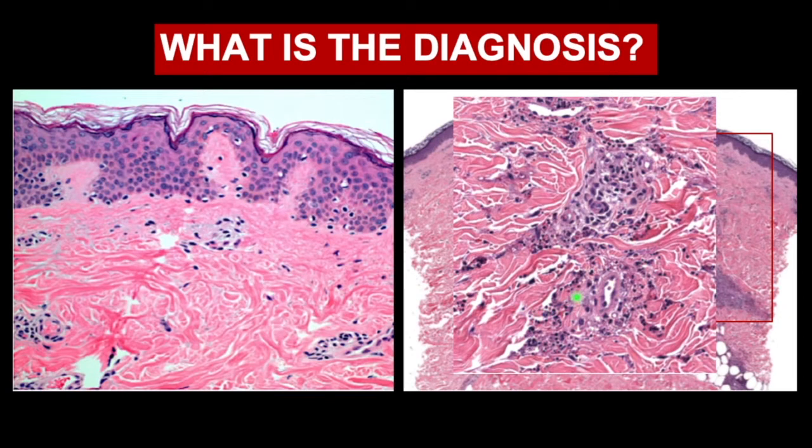and you see all these debris, we call it leukocytoclasis. All these are debris because of the neutrophils. After they are attacked and die, they go into apoptosis. So you see all this debris of the neutrophils because of the vasculitis.